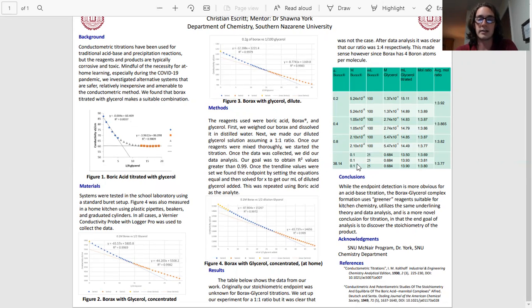And it utilizes the same principles as a titration, and the end goal is to find the stoichiometric endpoint. So you get to figure out the mole ratio. It's unknown before. Instead of figuring out an unknown concentration, you're figuring out an unknown stoichiometric product.